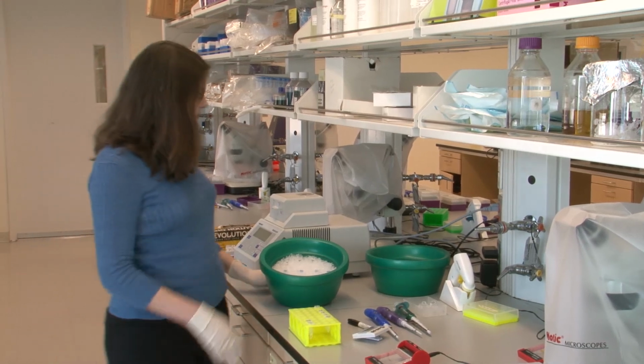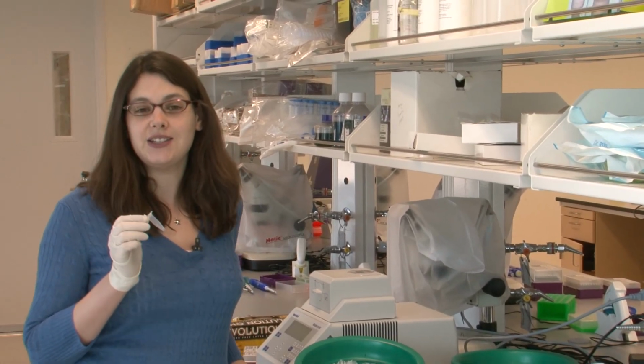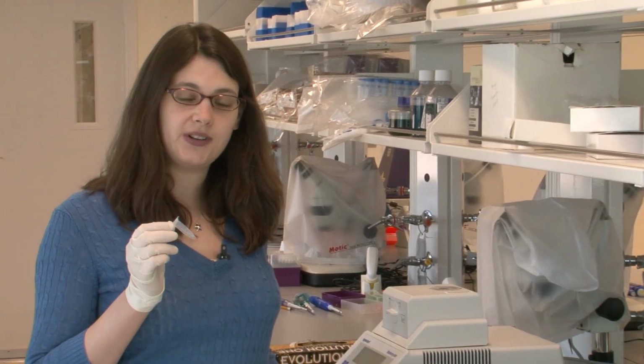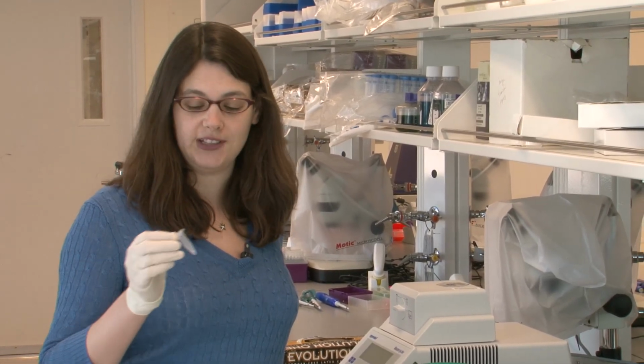So, typically we store our DNA samples like this in these tubes, and I got these tubes out of the freezer. Typically we store DNA at -20 degrees Celsius, which is the temperature of a standard freezer.